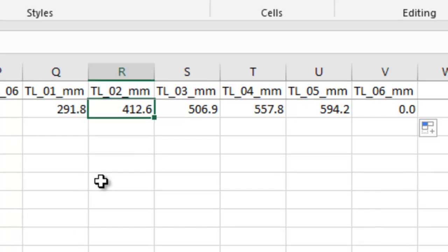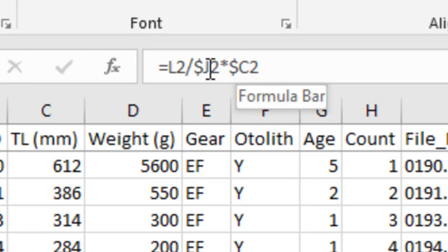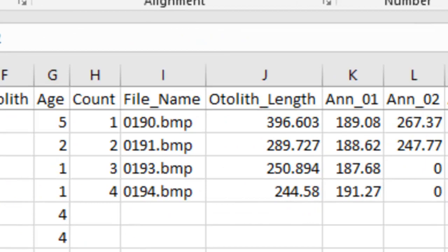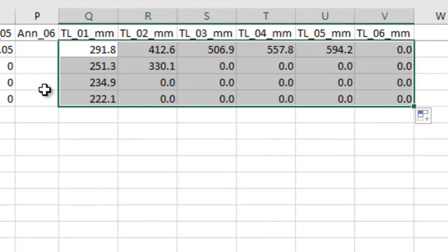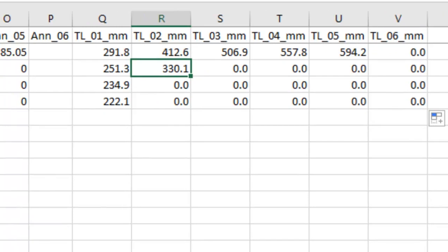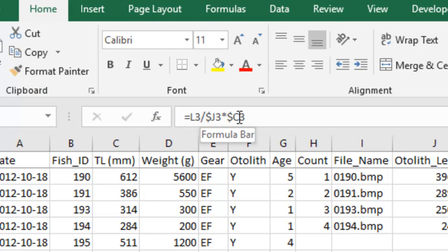Note that I don't put a dollar sign in front of the row number — we don't want to lock to the row because each row is a different fish. We just want to lock to those columns. So now if I copy this formula down, it updates correctly for every fish. If I look at H2 for another fish, it looks in the correct row but still references the proper columns for each calculation.